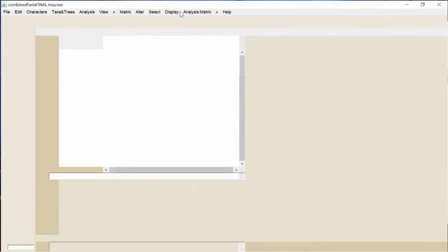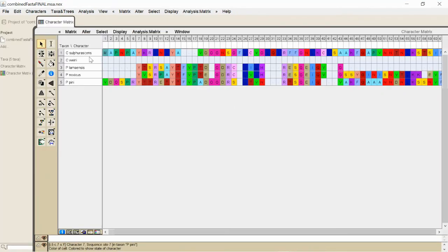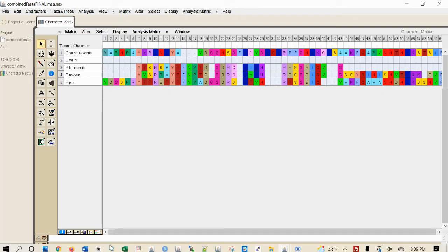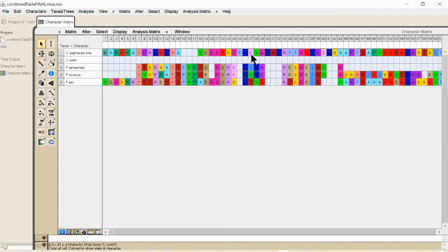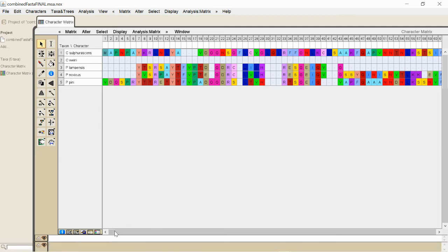And what this allows is it allows you to visualize, visually look at this multi-sequence alignment. You can see here, these are the amino acids, and they're lined up by position.